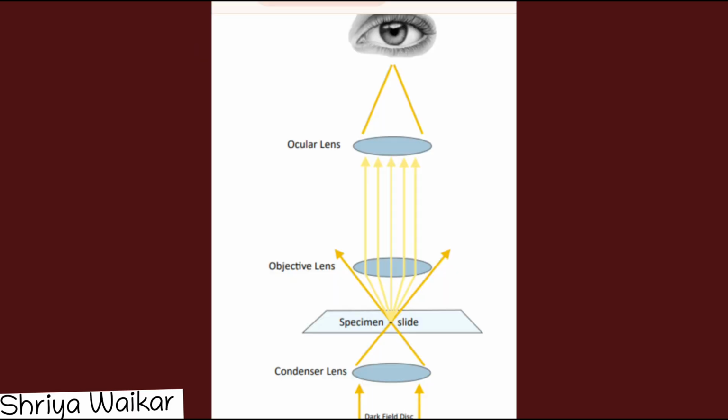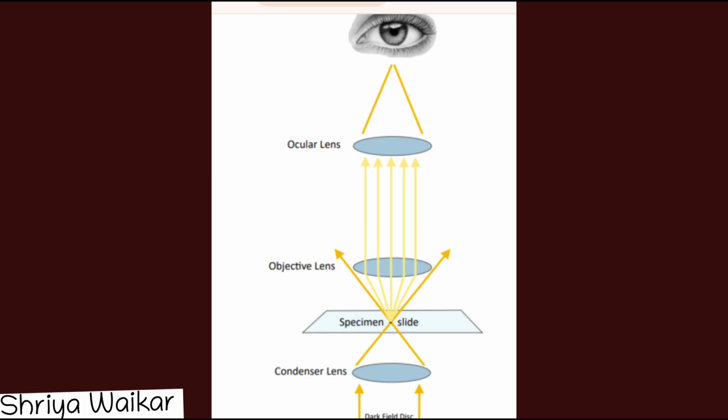There is an eye magnifying image, and there is an eyepiece. The projector lens is present, and then objectives and specimen, and then condenser, light, and the light source. At the very bottom of the microscope there is a light source.